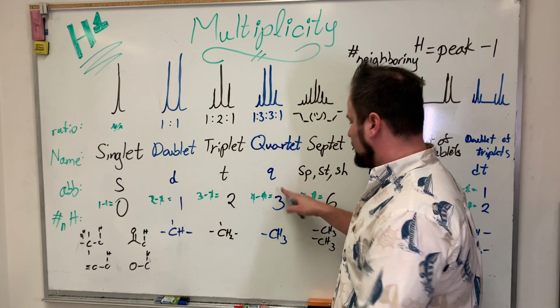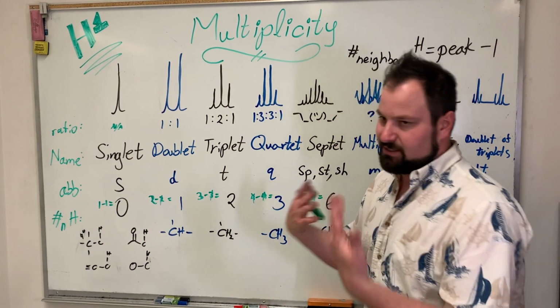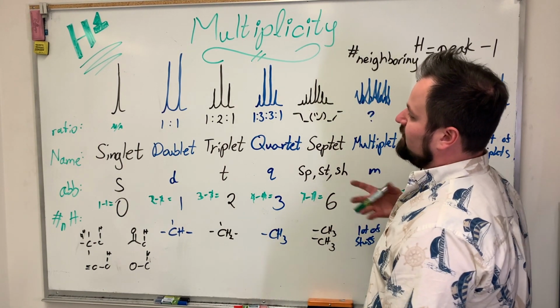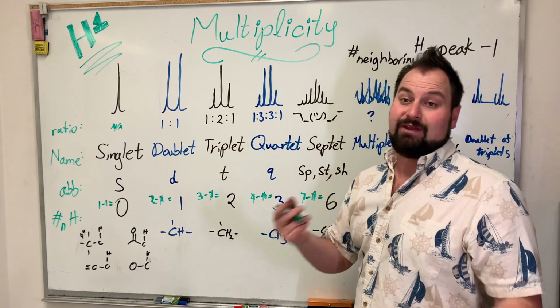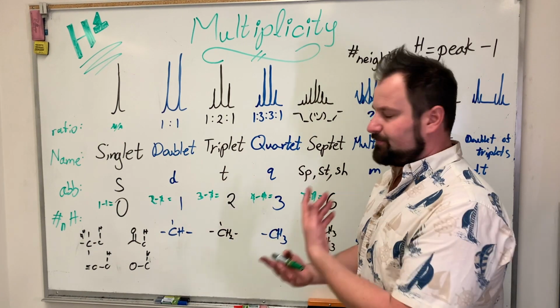Okay, it's usually a CH2. For here, 4 minus 1 is 3. That means this is usually a CH3. It's a pretty good sign. In particular, often you'll see these two together because you might have an ethyl group, so it's a CH2 and a CH3.